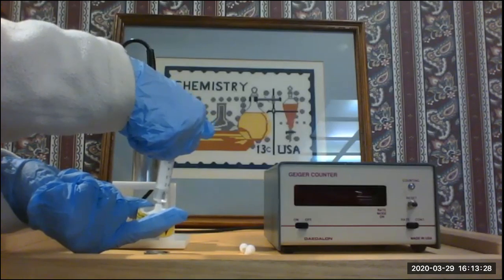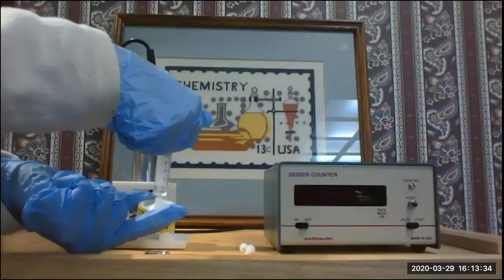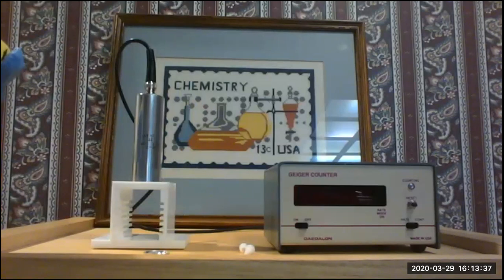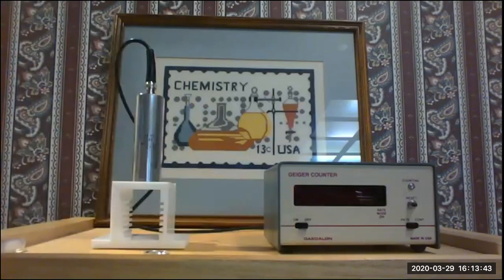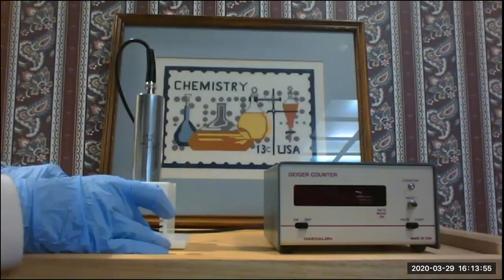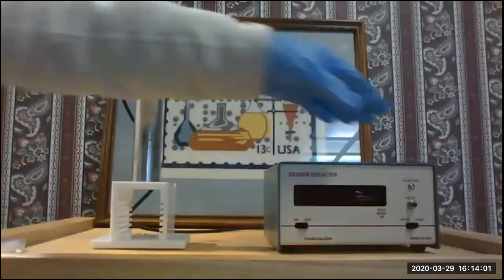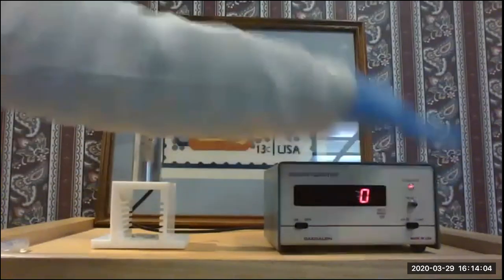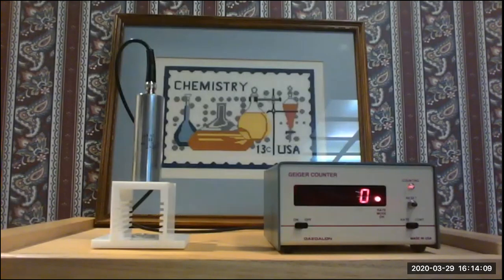First time this particular one is being used. All right, so there we have it. I'm going to replace the caps. And then place the dish inside my Geiger counter. I'm going to turn on the Geiger counter and reset to start taking counts. And as you can hear, the activity is fairly high.